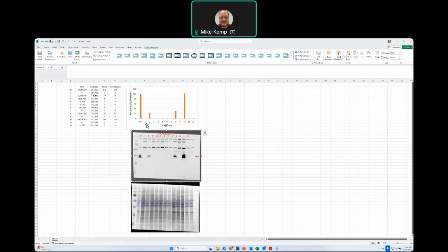And so ideally, numbers don't mean anything on a blot necessarily. They should reflect what the images actually look like, right? So there's about a 4 or 5-fold difference between lane 1 and 3 in terms of the intensity in the wild type and clone number 2. And so you should be able to sort of visually say, okay, yeah, that looks like it could be 4 or 5-fold higher. Now, sometimes you'll see people show data where that doesn't appear to be the case. And that could mean they quantified their data incorrectly or something. So people should be able to look at the Western blot and your graph and say, yeah, those two things line up just fine. So you can put everything in Excel if you like.